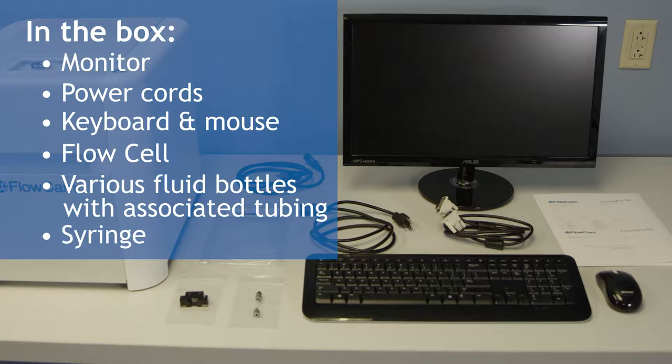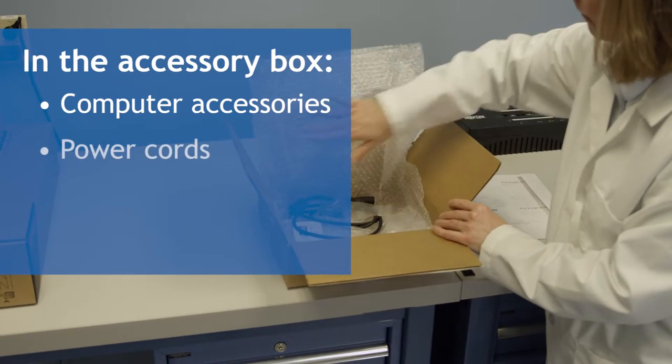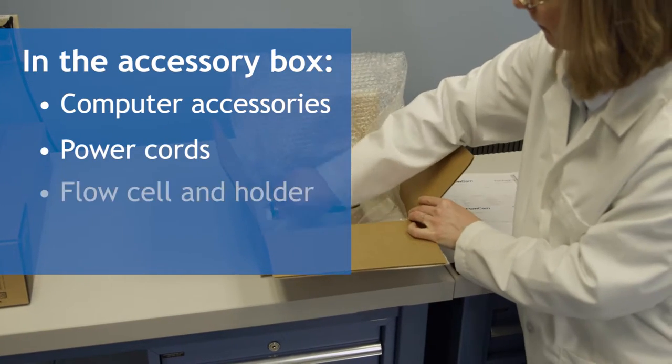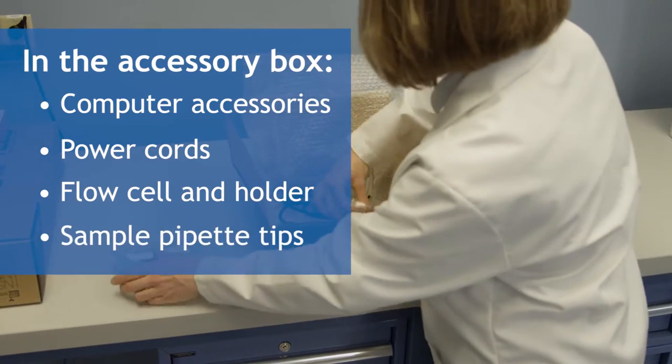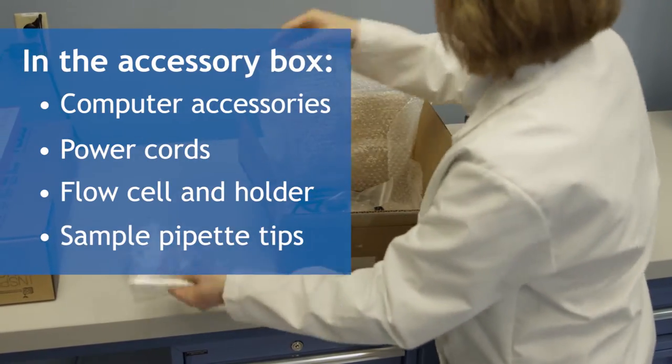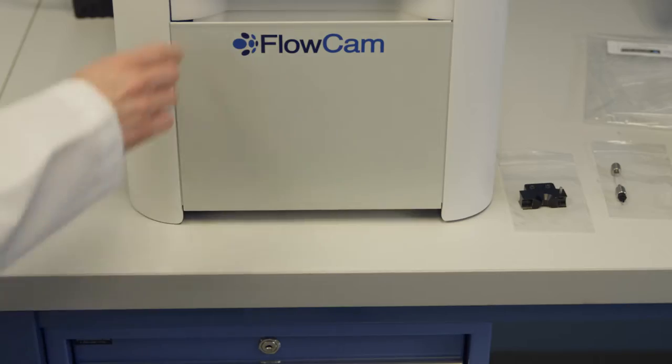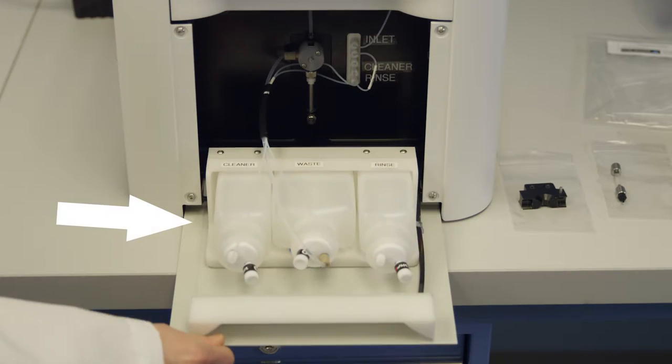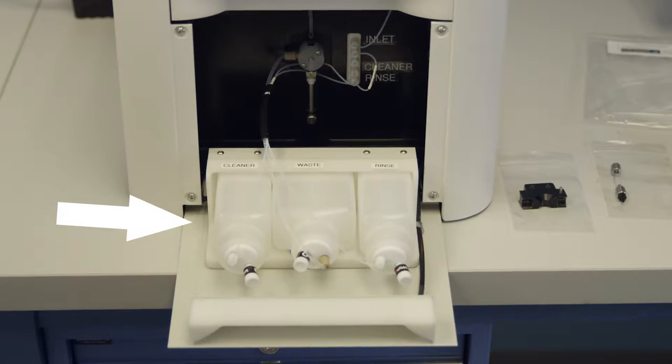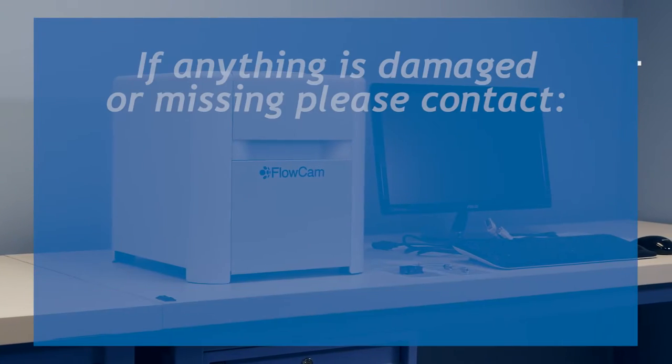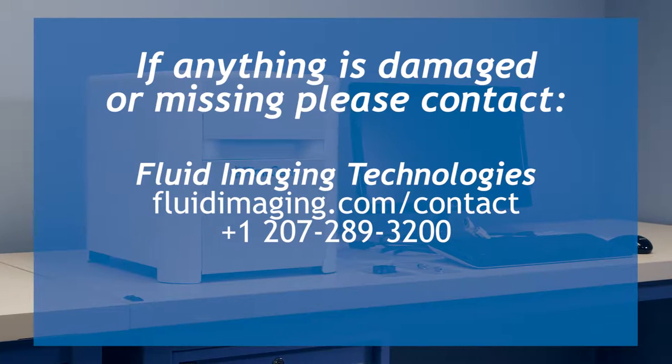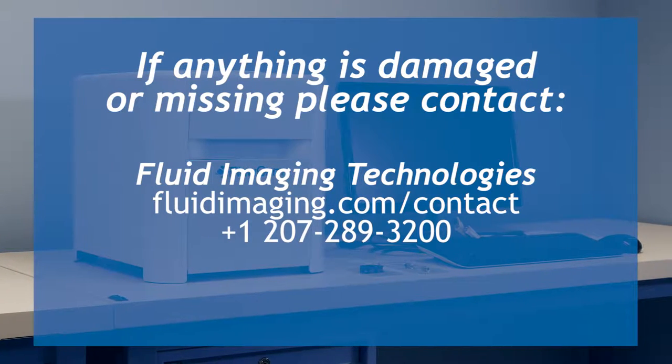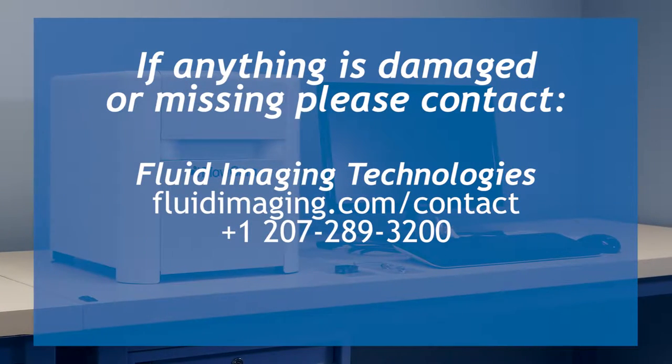The computer accessories, power cords, flow cell in the holder, as well as some sample pipette tips will be located in the accessory box. The fluid bottles and syringe will already be located in the instrument. If you suspect anything has been damaged or is missing, please contact Fluid Imaging Technologies or your local distribution representative right away.